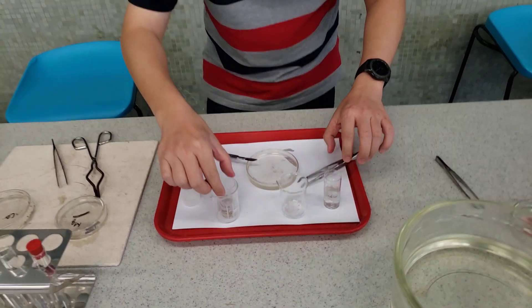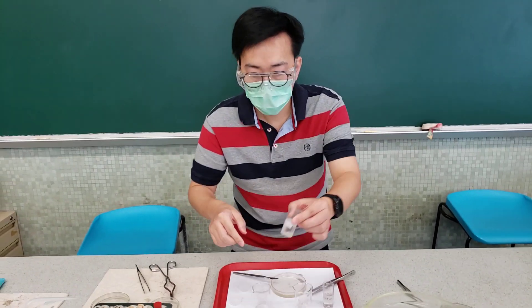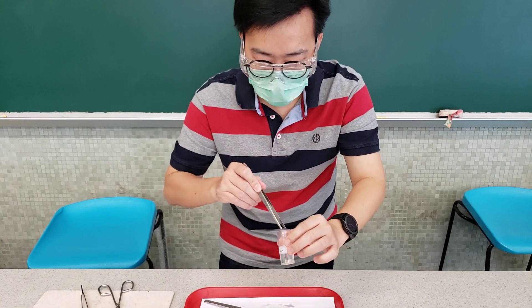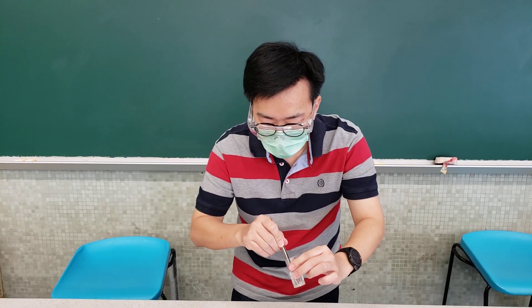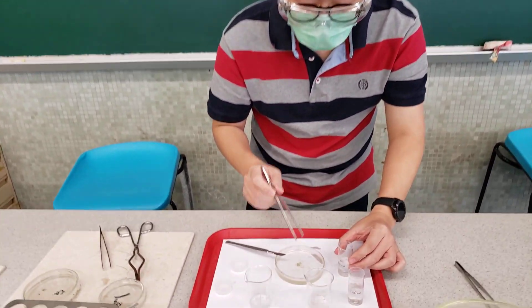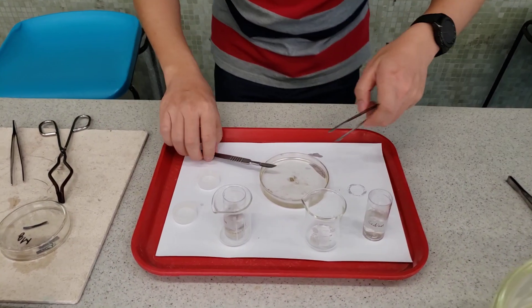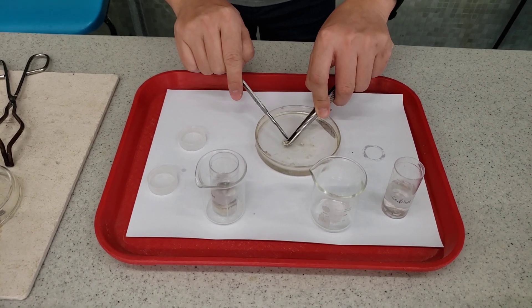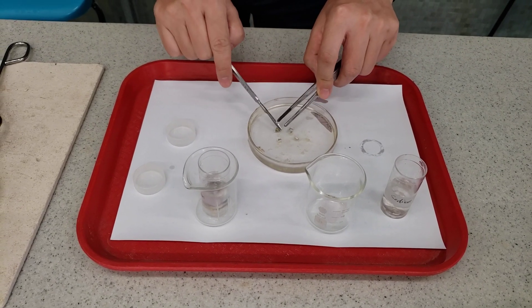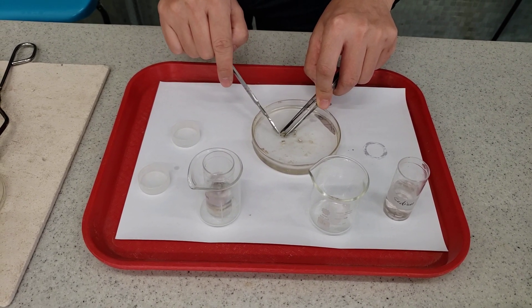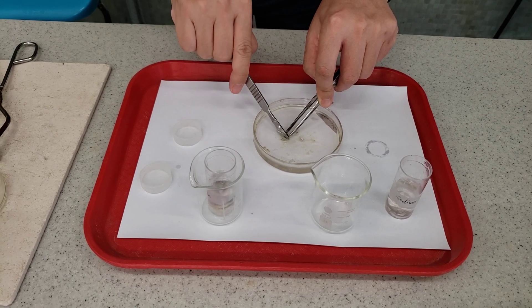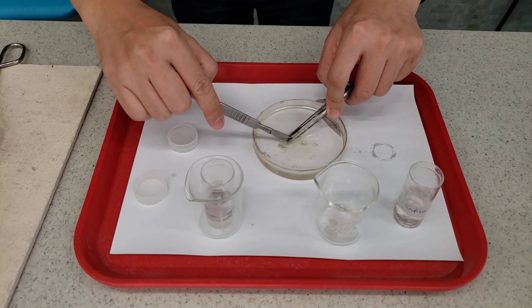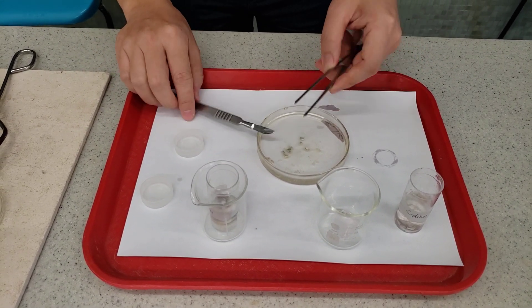Next, let's take a look at potassium. Potassium is another group 1 metal. I try to cut the potassium into pieces — let's see if it is again soft. Oh, I even didn't need to apply any force. I just press the knife a little bit and the potassium was cut into pieces.